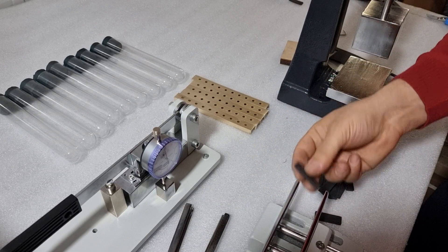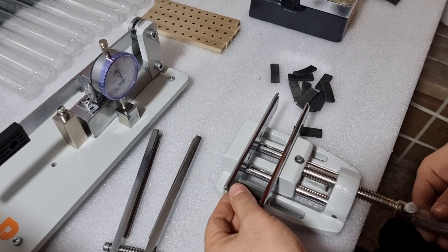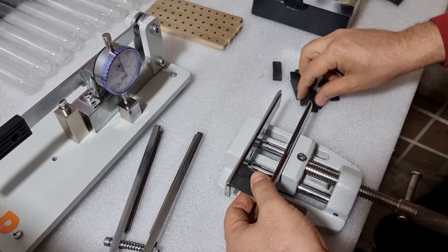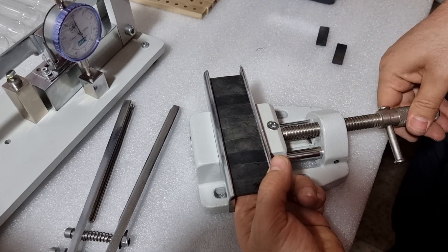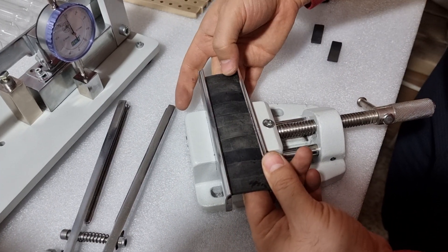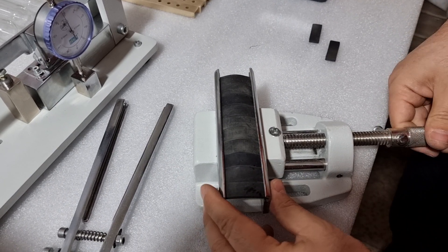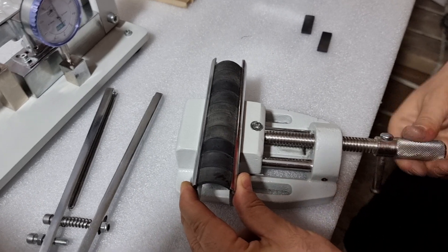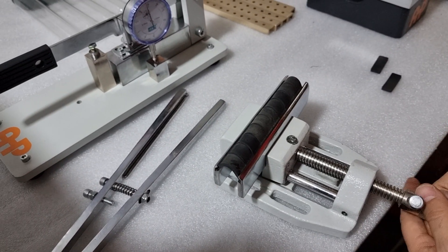You will prepare notches in the lengthwise direction at the midpoint of the sample piece for 10 or 100 pieces of samples as per standard. Then put all these sample pieces into the bending tool — 10 pieces of samples need to be placed here for bending.